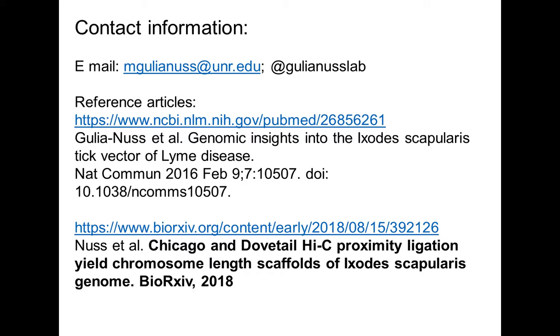Yeah, okay, sure. I think Monika addressed one of the challenges already, which is, with something as small as a tick, how do you minimize heterozygosity? And for doing a scaffolding project, we need at least 500 nanograms to a microgram of DNA for the Chicago step. And we also need, obviously, tissue for the Hi-C step. Monika was saying that luckily a single tick produces so many eggs that we don't have too much of an issue with that with her project.